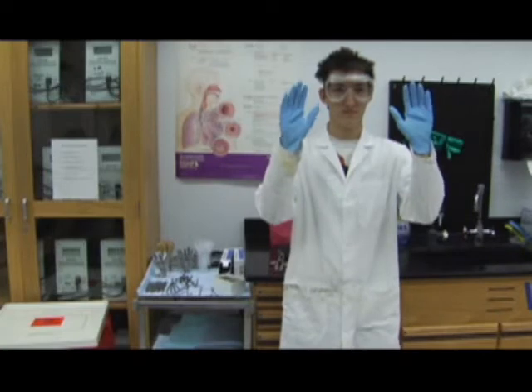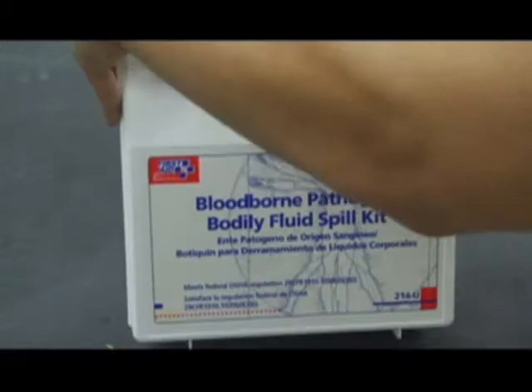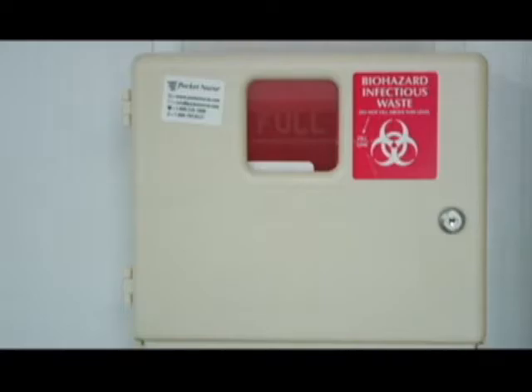Any employee handling biomedical waste shall wear minimum protective clothing, including a minimum of gloves and safety goggles. Finally, in the event that you need to decontaminate a biomedical waste spill, utilize a prepackaged biomedical waste spill kit. We use the blood-borne pathogen bodily fluid spill kit. The kits are located in room 109 in Building 2, also known as the Sterilization Dental Lab. The kit is mounted on the wall.